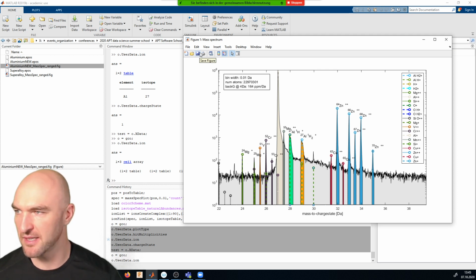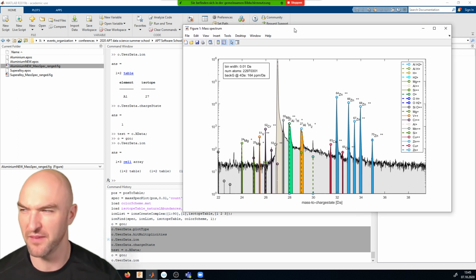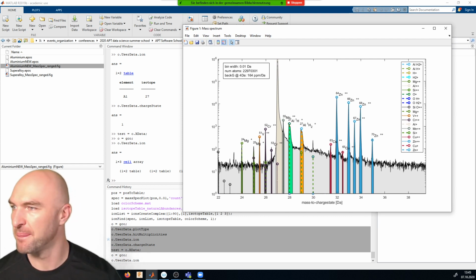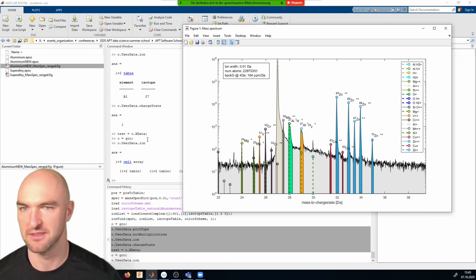If dot indexing is not supported for this, then you would be on a very, very old MATLAB version. No, that's not it. Then you have not selected something. Then you have not selected a graphics object. If you have a graphics object, dot notation is definitely supported.